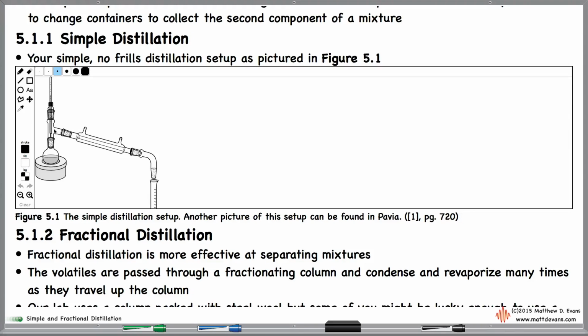Round bottom flask, this is called a three-way adapter is the next thing. And a temperature goes through the thermometer adapter, and the placement of the thermometer bulb is really critical because you want the top of that thermometer bulb to be right in line with the three-way adapter, and that's the perfect positioning, so make sure you get that set up correctly.